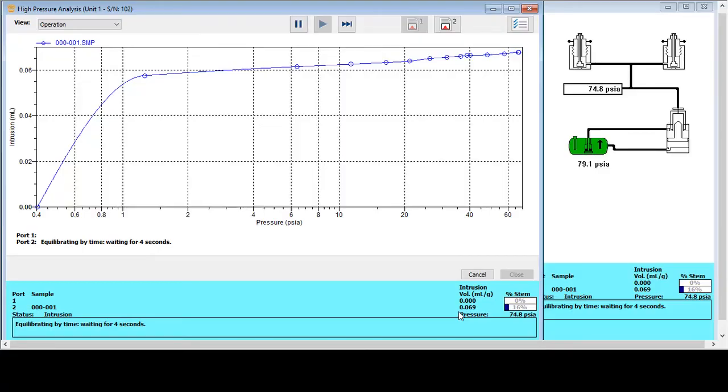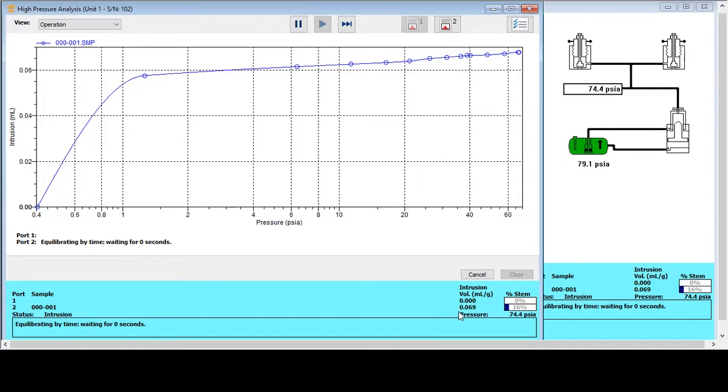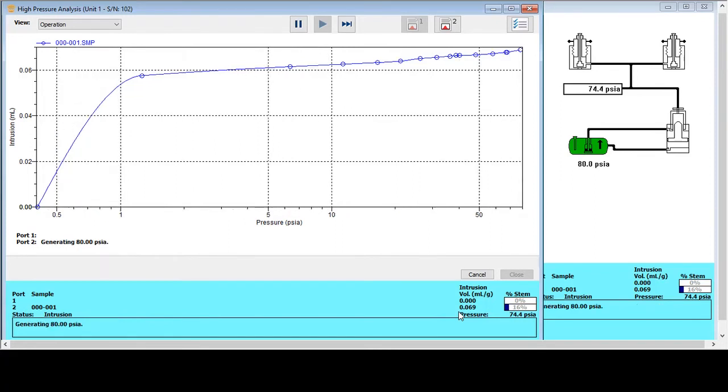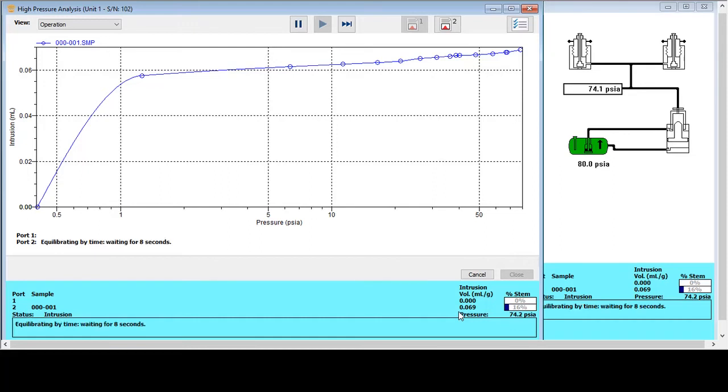So the high pressure analysis has now been started. And this is going to continue from the end of the low pressure analysis, so 50 PSIA. It will continue from 50 PSIA right up to 60,000 PSIA, and that's going to correspond to a pore size of 0.003 microns in diameter. The pressure will be increased through a series of predetermined increments that have been programmed into the controlling software. And these increments just like the low pressure data are determined by knowledge of the sample or method development on the sample, so that we can try and get as good a definition as possible to regions where we are seeing intrusion into the sample.